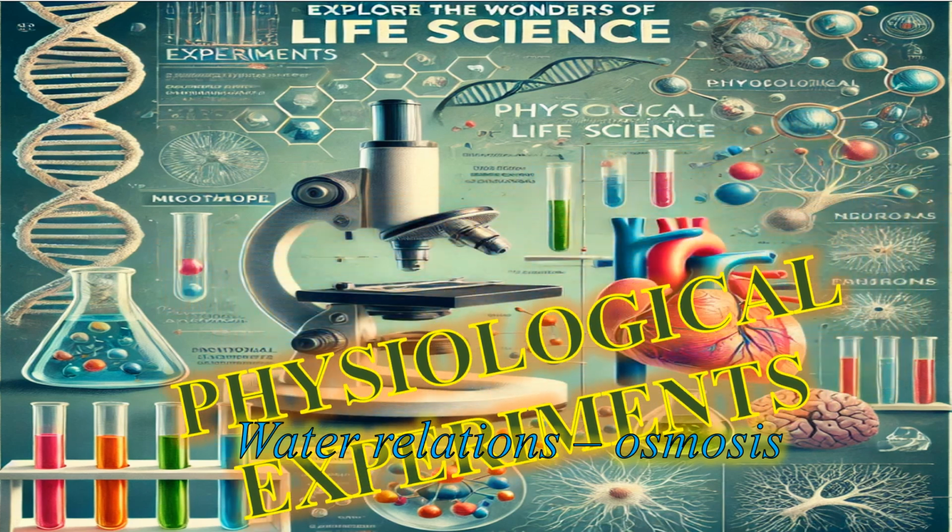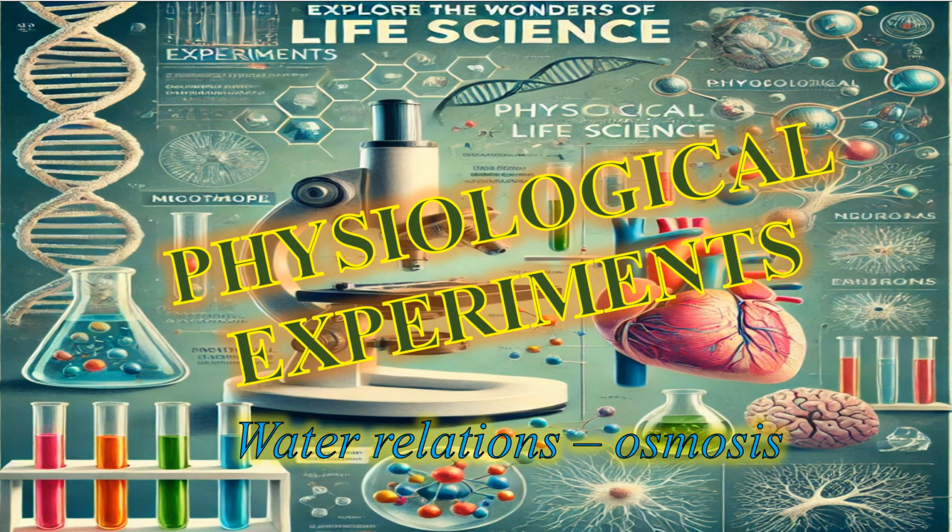In this presentation, we are going to look at osmosis in living tissues, evaluating the effects of various solutions on an epidermis peeled from the lower epidermis of tradescantia.